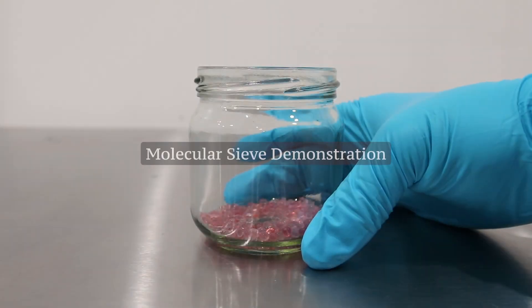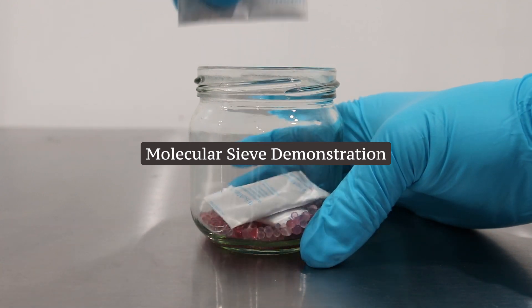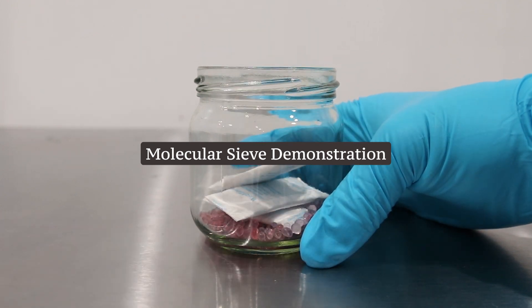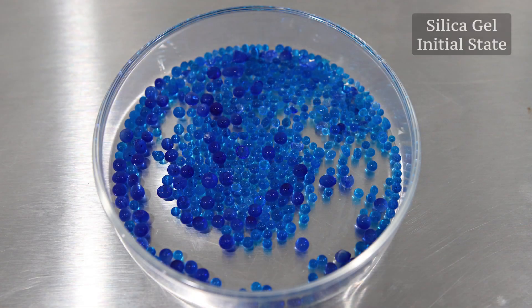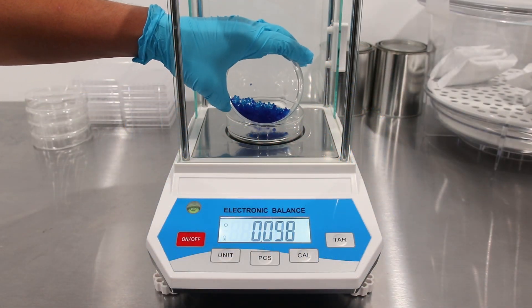In this video we will explore the impressive efficiency and rapid moisture absorbing abilities of molecular sieve. Our demonstration begins with blue indicating silica gel, and we measure its weight in grams. The initial weight is 10.038 grams.